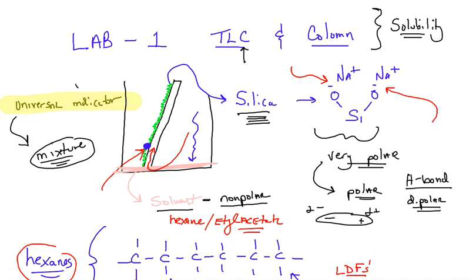So what do we have in chromatography? We have 2 things. We have a stationary phase, and let's write that. Our stationary phase in this case is the silica. And then we have the what? The mobile phase, which is the nonpolar solvent, mostly. So we're giving the mixture a choice. When the solvent gets pushed up by capillary action, and we spot our plates accordingly with little tiny spots, we give the mixture a choice to either stay with the silica or move with the solvent.